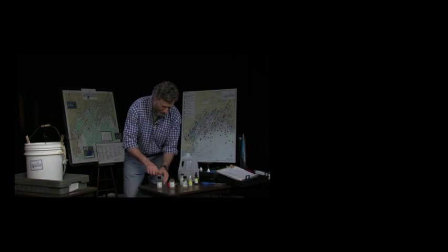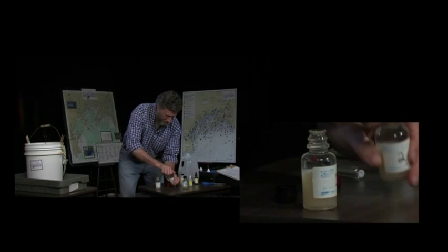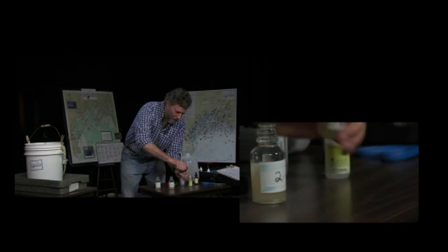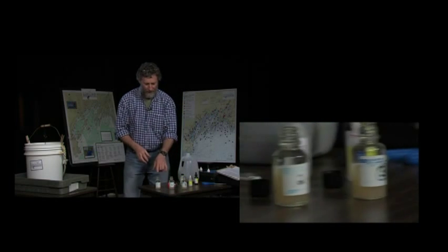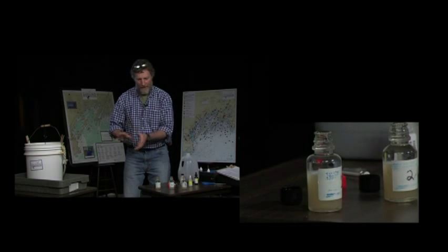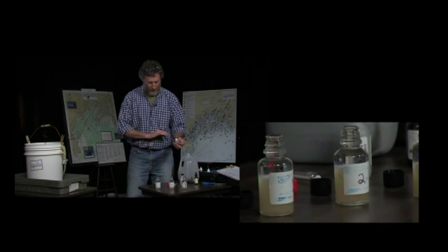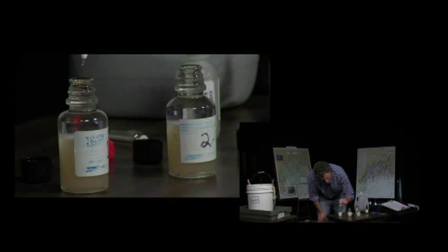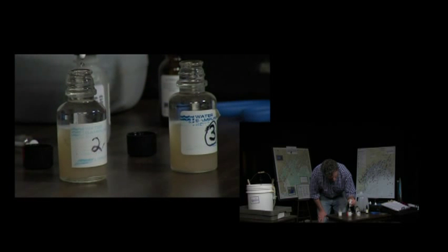And I'm going to go ahead and do that quickly now. And again, you want to add it to all 3 bottles at the same time. You don't want to add the sulfuric acid to one bottle and then do your titration and then go back and do the other 2. You want to kind of do them all at the same time. We'll add 8 drops to each.